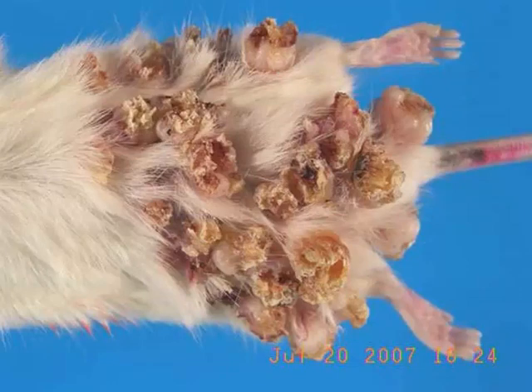Papillomas. This was an animal that was a transgenic mouse which was treated locally with a carcinogen promoter and ended up with large numbers of papillomas over the areas of the body that were treated. We used to have to paint these animals to get something like this. Now there are a lot of transgenic mice which develop these on a regular basis at a very young age as a result of KRAS mutation. So as I said before, you can make a transgenic mouse do just about anything you want, as long as you know which gene to knock in or to knock out.